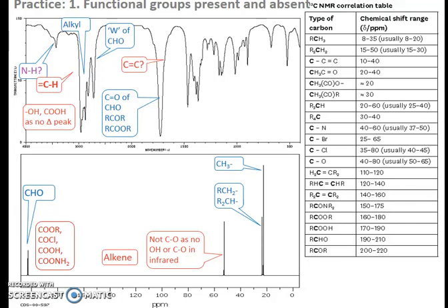Similarly, we have a peak at 1720 or thereabouts on the IR. And again, that could be an aldehyde or a ketone. But more importantly, we've got that little shoulder peak at the side, about 2700, 2800 on the IR. That is really indicative of an aldehyde. So at this point, I'd be inclined to say this is probably an aldehyde.